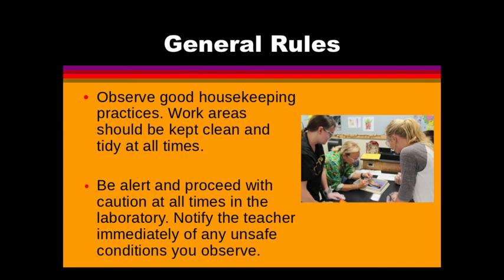Be alert and proceed with caution at all times in the laboratory. Notify the teacher immediately of any unsafe conditions you observe. I do notice that oftentimes, like if we are picking up a liquid, or we're picking up our trays of materials, you feel like you need to run to go get those. There are plenty of materials for everybody. I don't need you running from place to place. I don't need you walking fast, because whatever spills, you're going to have to clean up. So we need to make sure that we're safe and we're cautious, and that we're not running and we're not horseplaying.